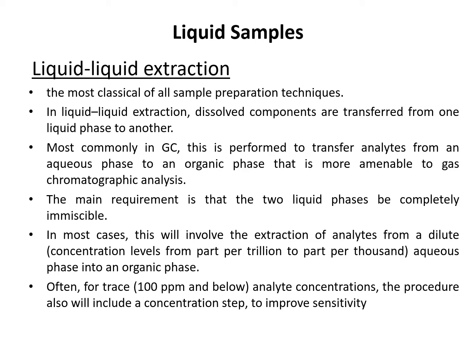The main requirement is that the two liquid phases be immiscible. In most cases, this involves the extraction of the analyte from a dilute aqueous phase into an organic phase. Often, for trace analysis, the procedure also introduces a concentration step to improve the sensitivity.